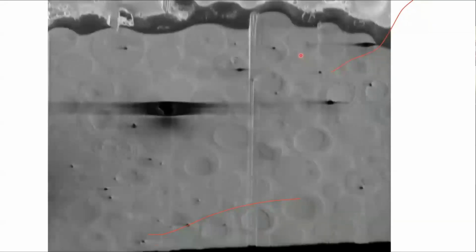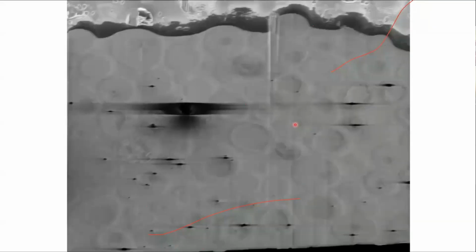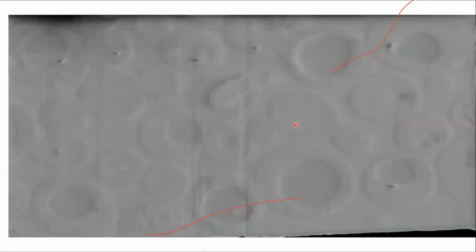Each cell completely we could see in these conditions. The next tomograms we have generated, there is a little ice contamination. We are standardizing this. But see this, the whole cells, even the dividing cells and others, you could easily identify, and the tomogram can be generated by this.